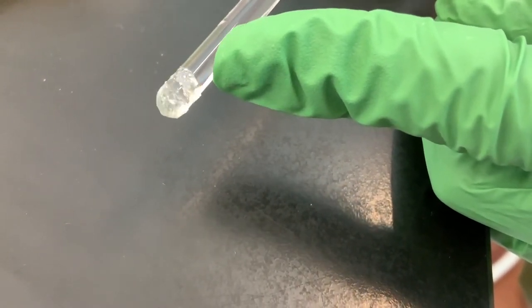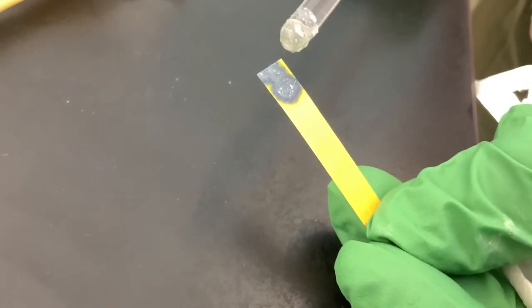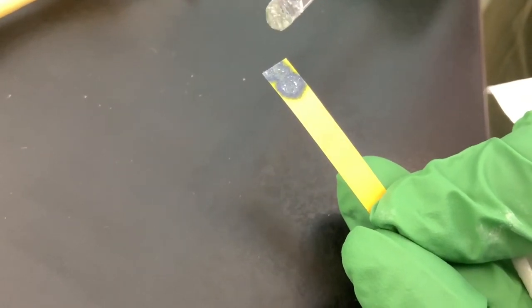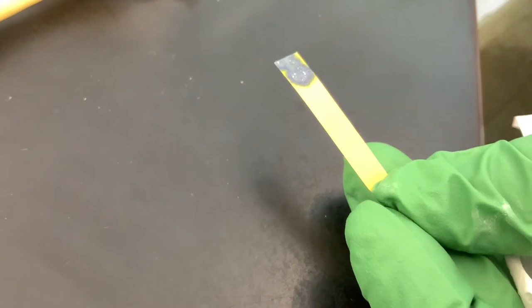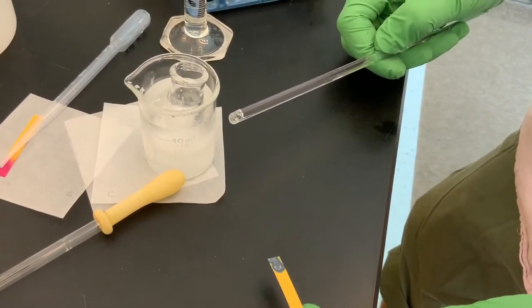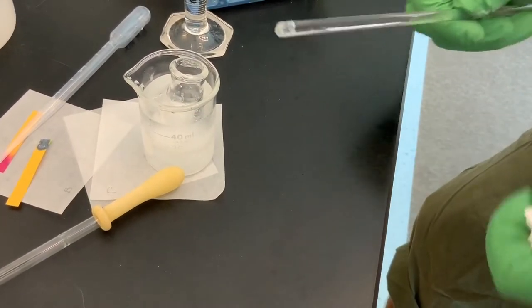So I'll probably use this to help me scrape everything out of the flask in terms of filtering it. And then you can even see a little white solid on the pH paper itself. And the blue is telling us that this is strongly alkaline. So we have it chilling, and what we want to do then is now isolate the solid via vacuum filtration. Remember, we use vacuum filtration to isolate a solid. We use gravity filtration if we want the liquid.